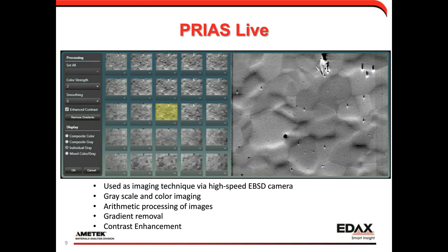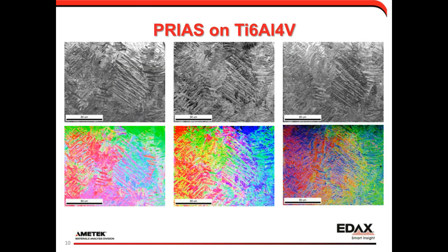Using PRIAS in a mode called PRIAS Live as an imaging technique, we're able to create grayscale and color images. We can do processing such as adding, subtracting, or weighting, remove intensity gradients from geometrical effects, and do contrast enhancements. It's a technique where we can get an image in a minute or two with a lot of information. Showing these different PRIAS images on Ti-64, depending on which quadrants we select and coloring schemes we use, the microstructure and laths inside different grains show up nicely for very quick microstructural imaging.